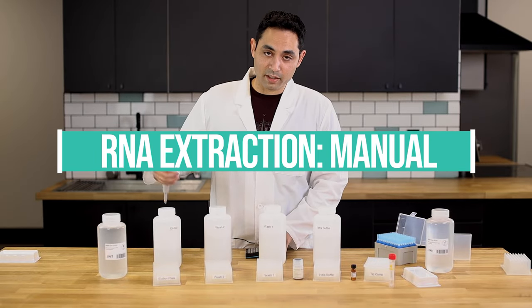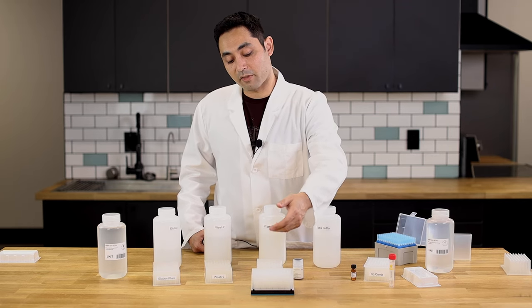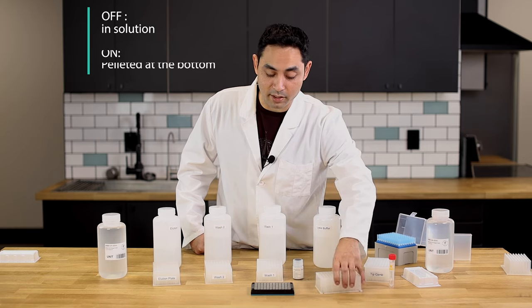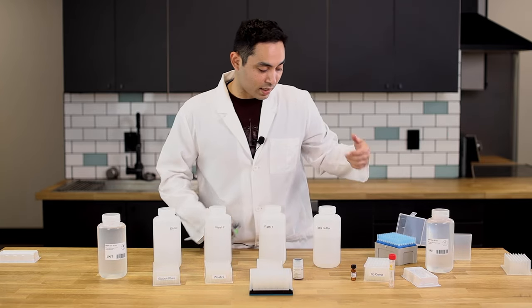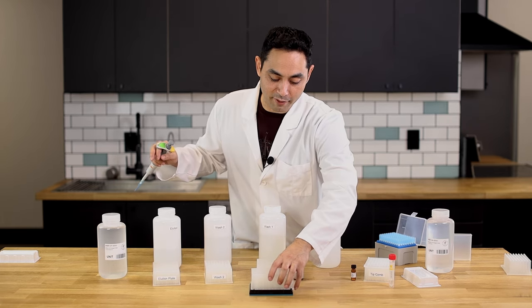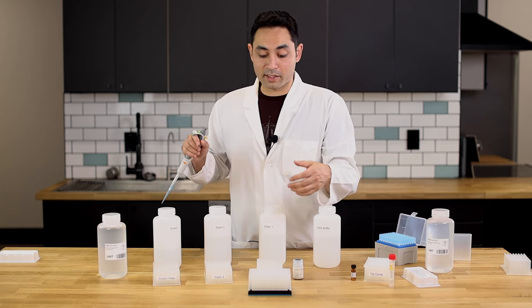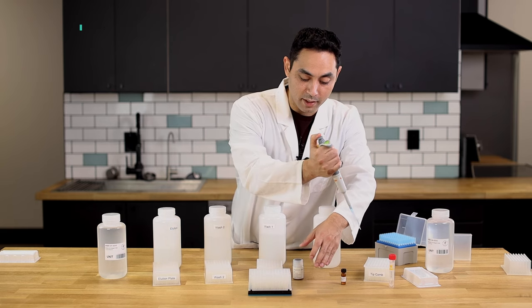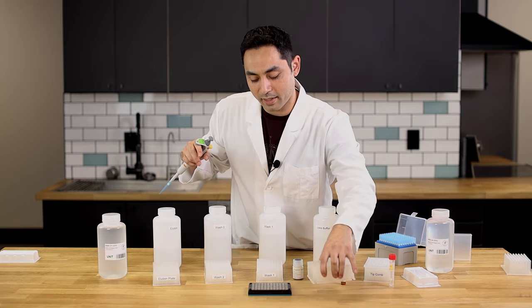If you're gonna do this manually — no machine — you can use a magnetic plate. Instead of the magnetic beads moving from station to station, the magnetic beads either stay in solution when off the mag plate, or get pelleted at the bottom when on it. So off means in solution, on means pelleted at the bottom. All the steps are the same, but when it's time to move the magnetic beads you don't move them — you just have one plate for everything. What you're doing is pipetting out the liquid and putting in new liquid. For example, going from lysis buffer to the wash step: everything's mixed, you pellet it on the mag plate, pipette out the lysis buffer, pipette in the wash, then take it off for mixing. Same concept, but one plate, going back and forth.